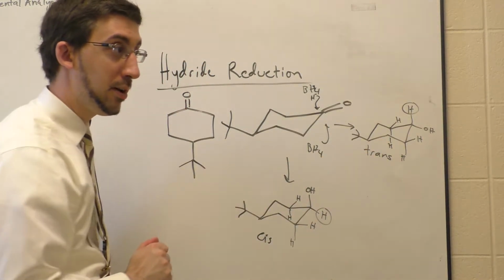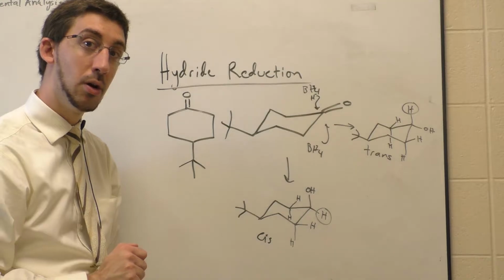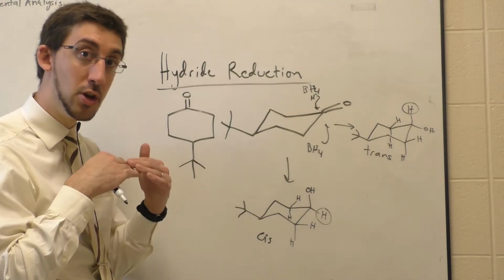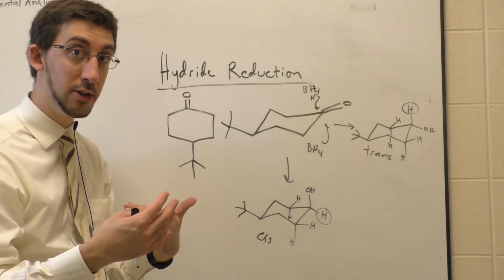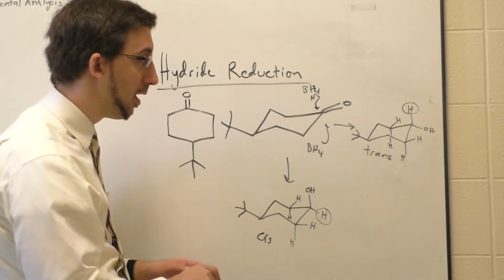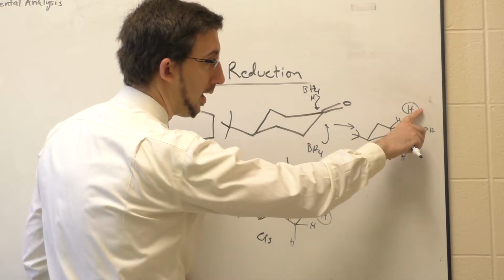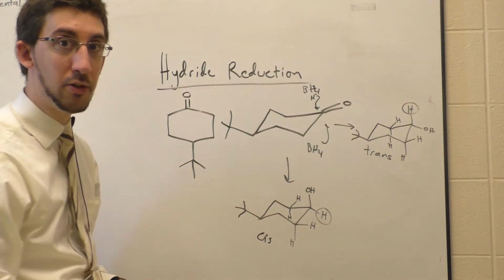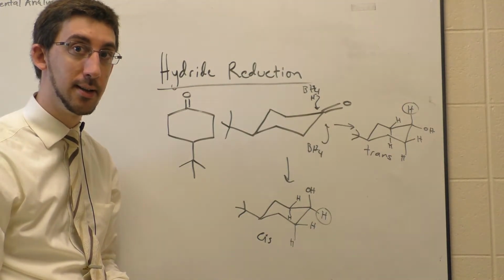But the coupling is much less, in fact close to 0, if we have a 90-degree angle between the two. Then we have essentially no coupling whatsoever, even though they're on adjacent carbons. Here, my angles are not 90 between the hydrogen here and the equatorial, but it's about 60 degrees. So it's a much smaller coupling constant.